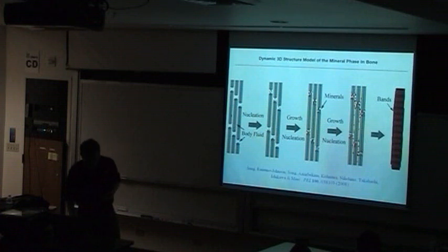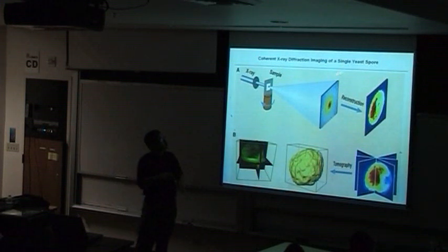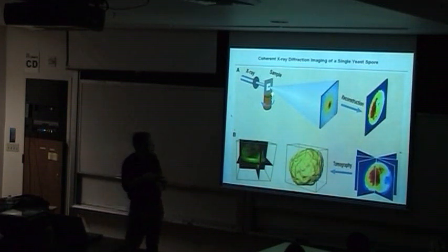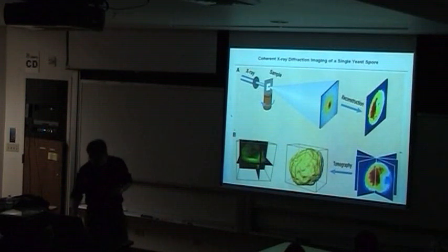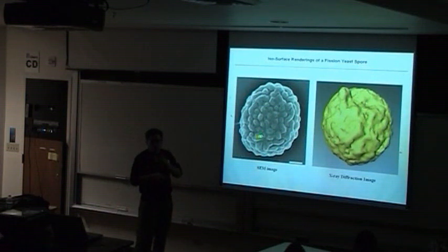Recently we tried coherent X-ray diffraction imaging of a biological sample, yeast spore. We chose yeast spore because it is relatively radiation hard and can withstand it, as we hadn't tried a fixed sample and wanted to see a 3D reconstruction. We get many 2D diffraction patterns, do reconstruction, and then get a 3D reconstruction. Here is the 3D reconstruction, and you can see the surface is very bumpy. This SEM image, not the same spore but similar, shows the consistency.